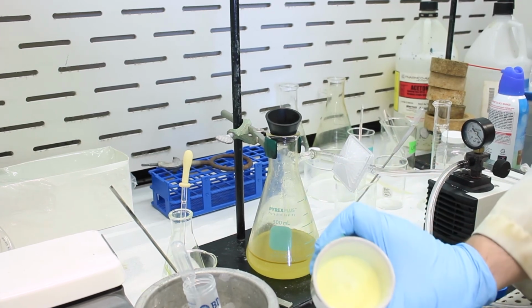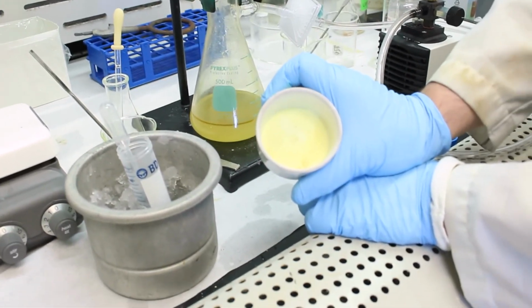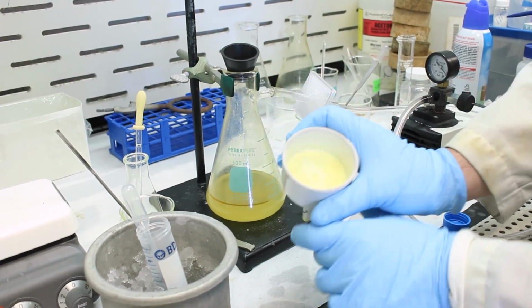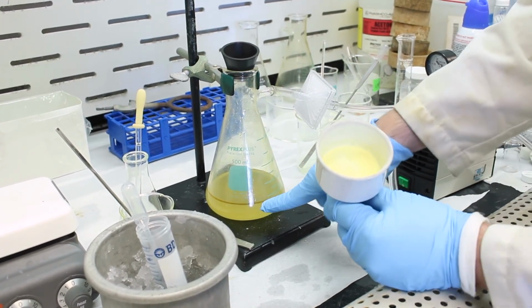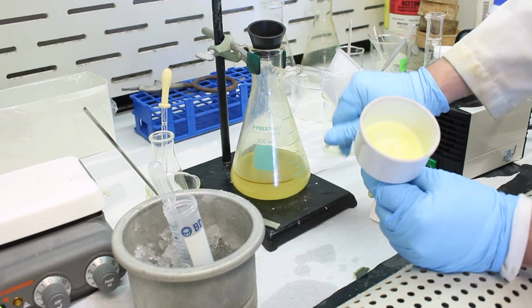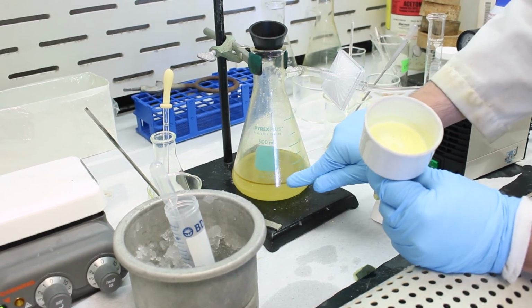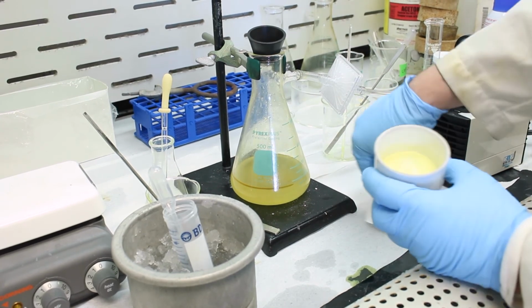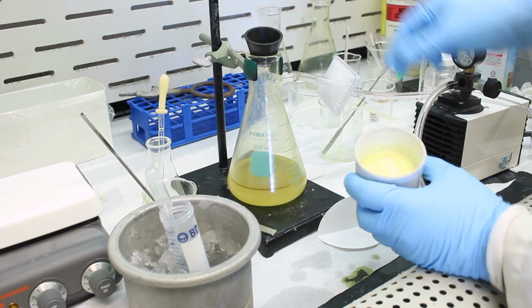Okay, and then there's the product. Those are the two boiling chips. We'll take those out. It looks like we might have lost quite a bit in the filtrate here. You can even see perhaps a layer where the ethanol is probably layering out, or a little bit of toluene is layering out at the top. So we'll see how low it is. Hopefully it's not too low.